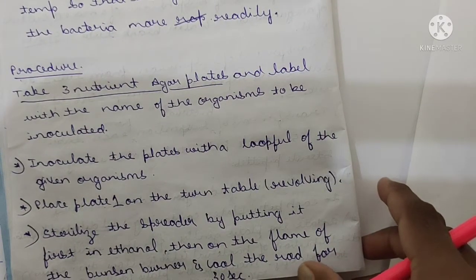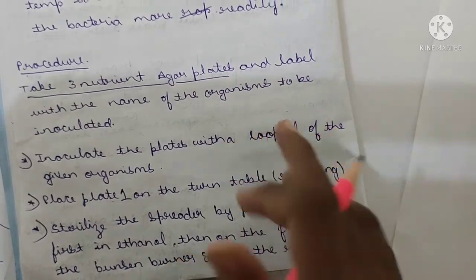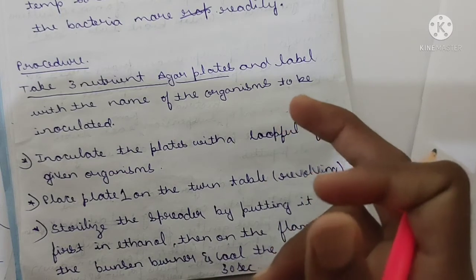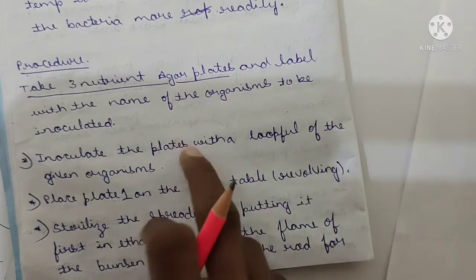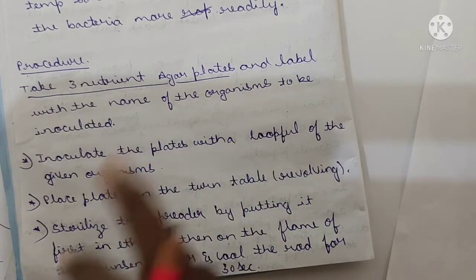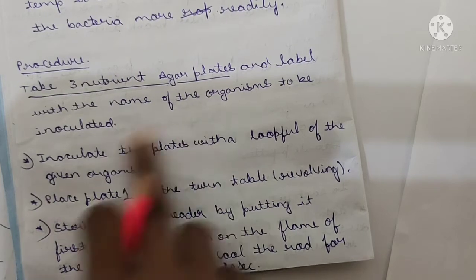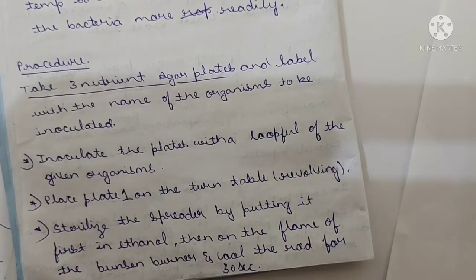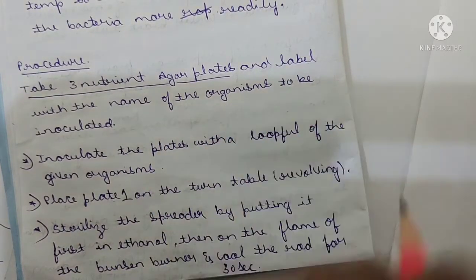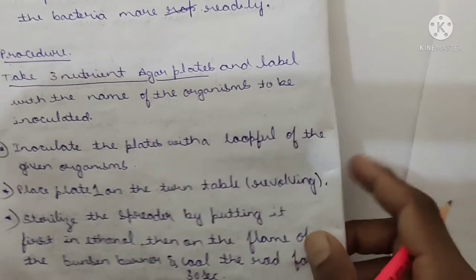spreader by putting it first in ethanol. We cannot put the spreader directly on the plate which contains the organism. We cannot spread with the help of that spreader directly. Why? Because it contains different types of microorganisms, and it gives you errors in your product.